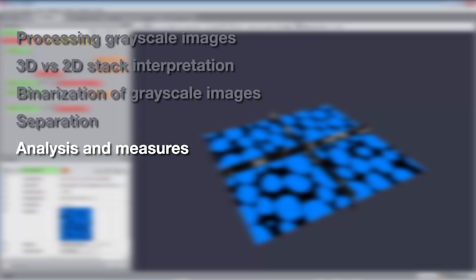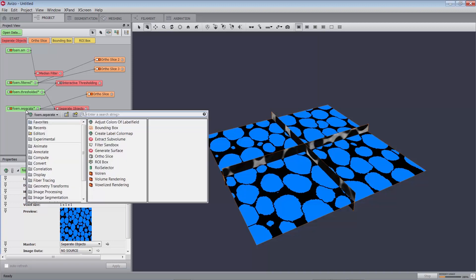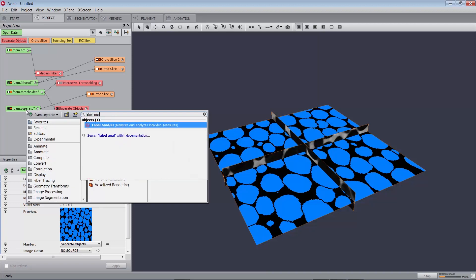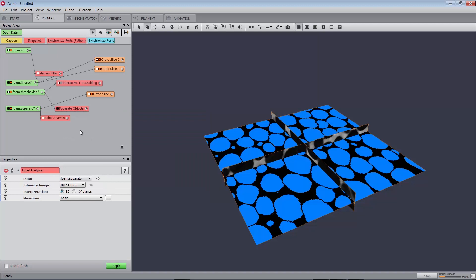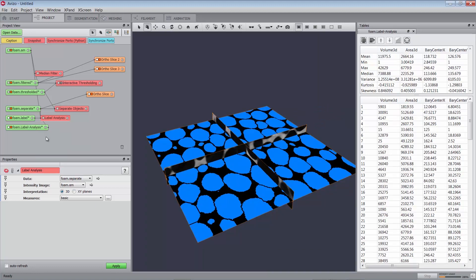Analysis. You can then use an Analyze module to get the volume, surface area, mean value, number of voxels, etc., individually for each separated particle. The analysis on the stack of images is undertaken by the Label Analysis module to extract statistical and numerical information, including the measure of objects. Attach a Label Analysis module to the separated data. Set foam.am as intensity image in the dedicated port of the module. Now press the Apply button. A new label image data object, foam.label, is created in the project view, and the Tables panel is displayed, showing a spreadsheet-style table of results. The analysis, foam.label-analysis, is also created in the project view.